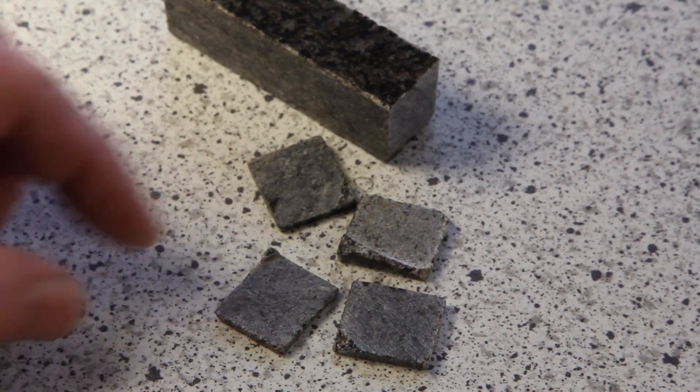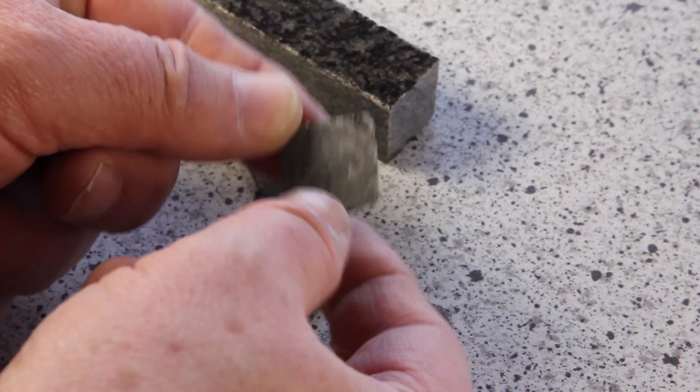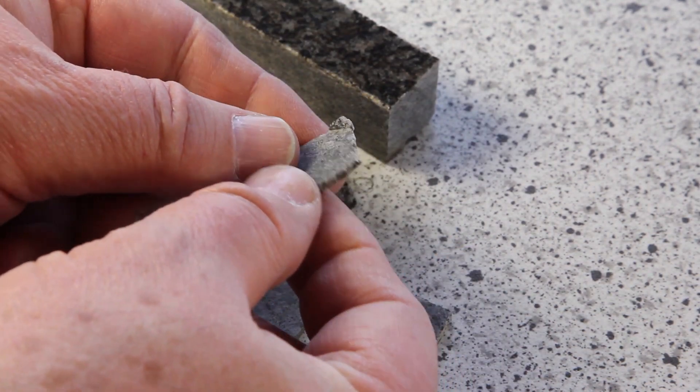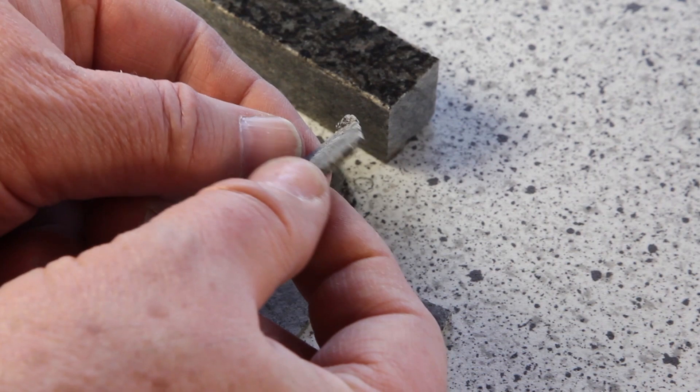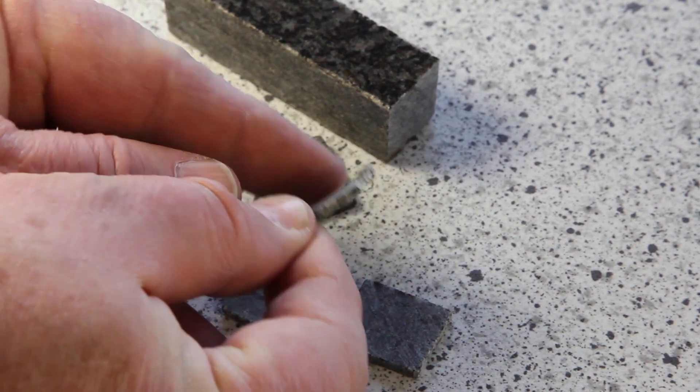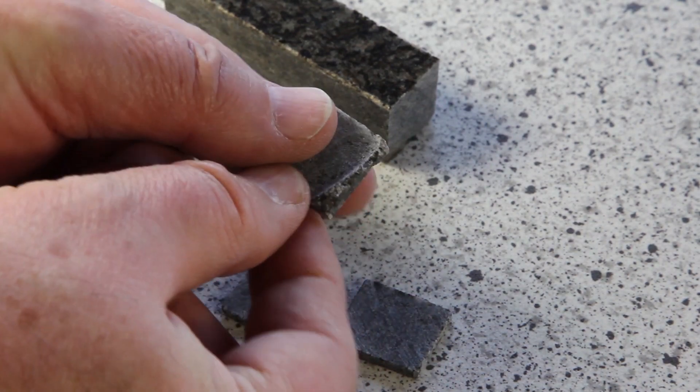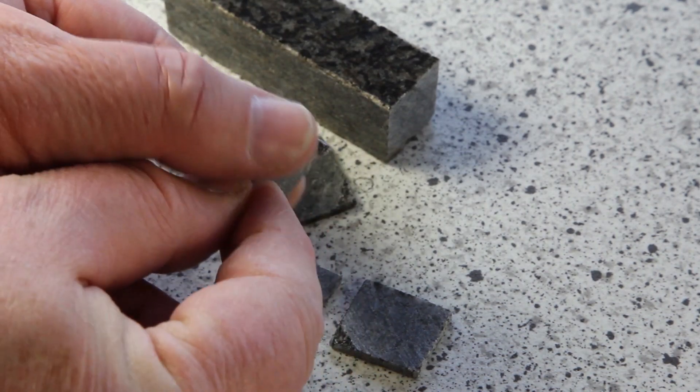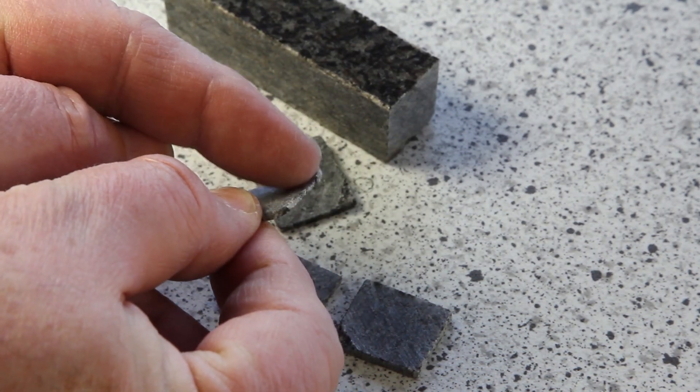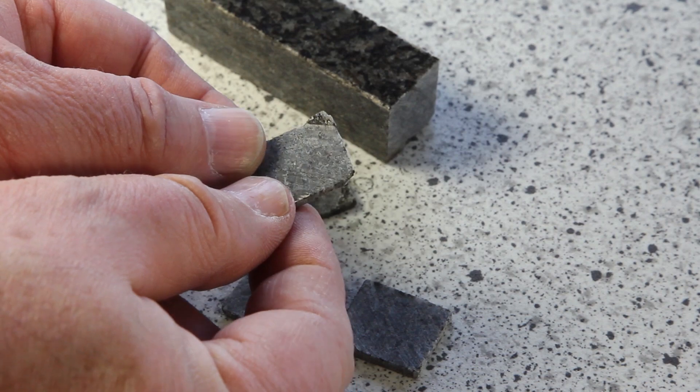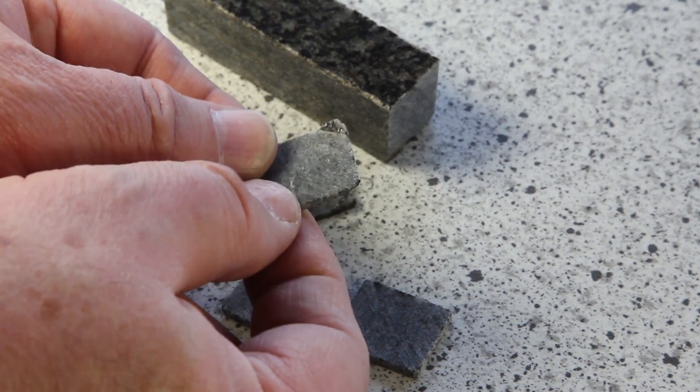I have to make sure that at least one side of the sample is more or less flat. Here you can see this side isn't flat, this side isn't either, so I have to grind this side first before I can glue it onto the slide.